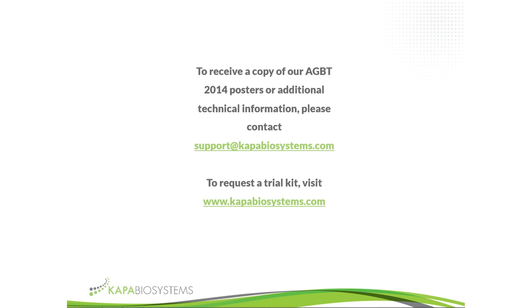Okay, excellent. Do you have any data showing the utility of the Q ratio with PCR-based enrichment rather than capture hybridization? We have worked with a few groups that have used the human Q ratios in amplicon-based workflows as well. Especially one group, and we've recently released a customer profile on that, Bob Daber at the University of Pennsylvania.